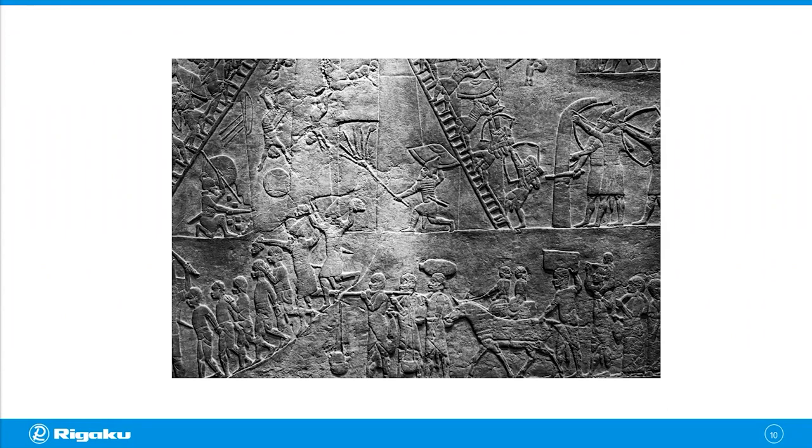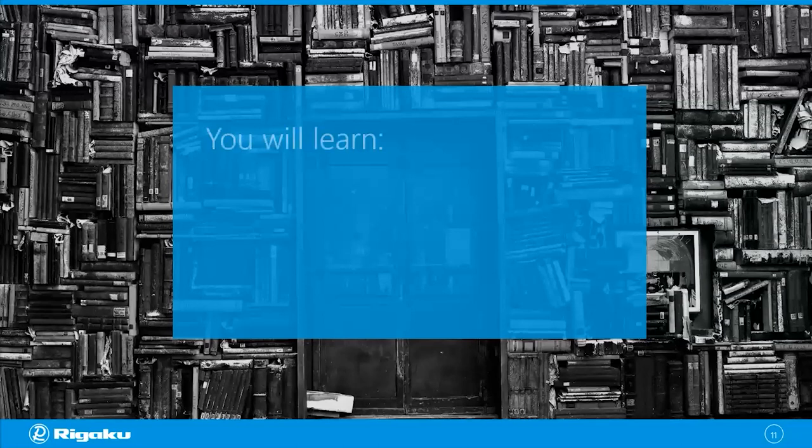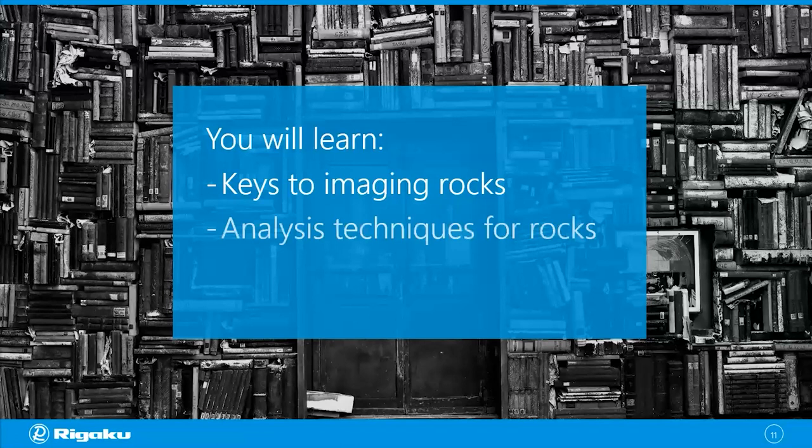The information that we're trying to extract from those stones or rocks is often visual, such as shapes or distribution of a certain phase. So image analysis is an important part of the study of those rocks. Either you're trying to learn something about the history of the Earth or maybe certain properties of the rocks as a potential resource. Today, we're going to take a look at how we can extract visual information from rocks using X-ray CT. So in this webinar, you will learn some keys to imaging rocks and analysis techniques that are useful for rocks. And we will take a look at a number of geology application examples.